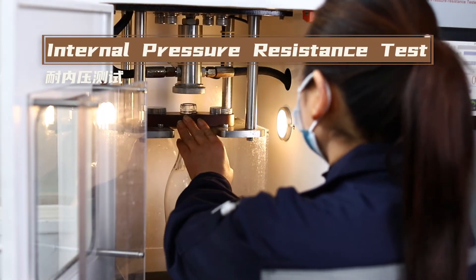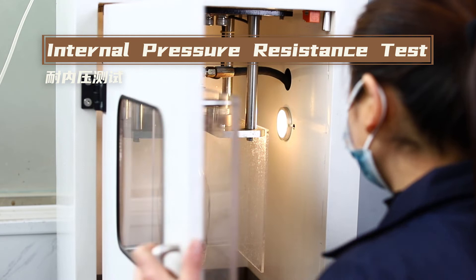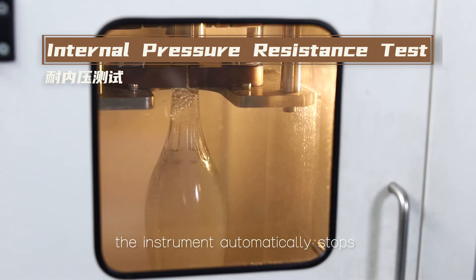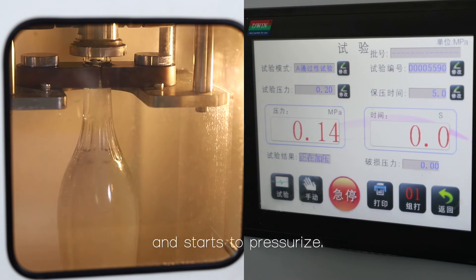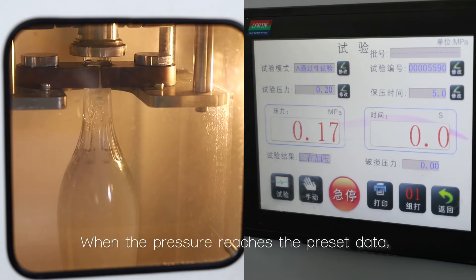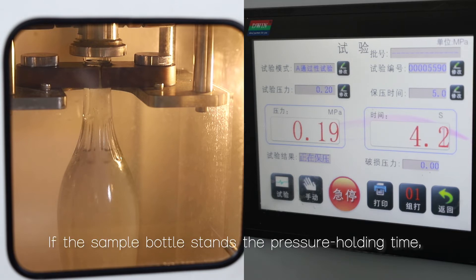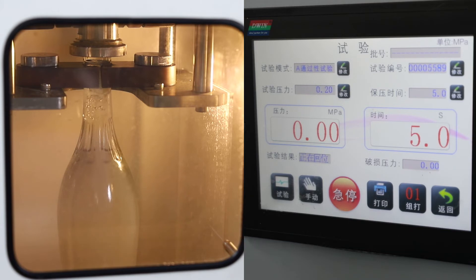Internal pressure resistance test. When the bottle is filled with water, the instrument automatically stops and starts to pressurize. When the pressure reaches the preset data, it starts to hold the pressure. If the sample bottle stands the pressure holding time, it features acceptable quality.